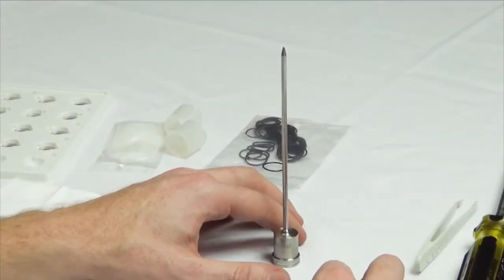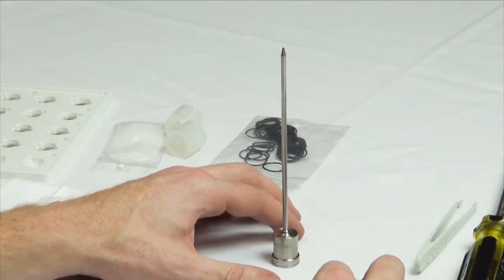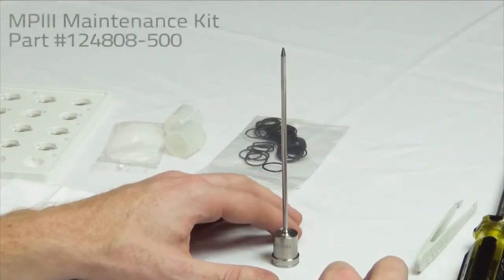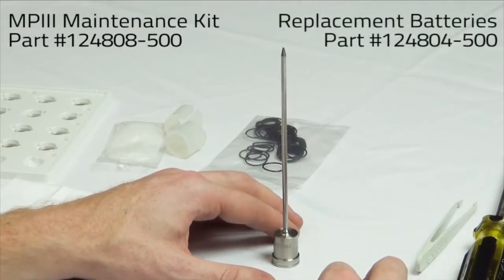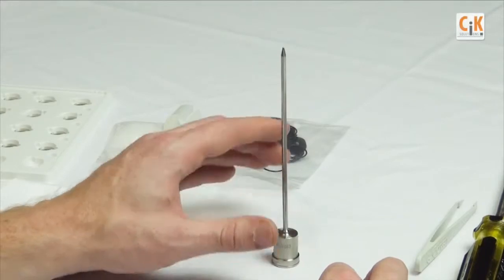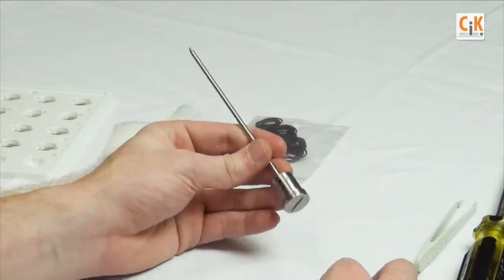In this video you're going to learn how to change an MP3 battery. This video assumes that you're using an MP3 maintenance kit part number 124808-500 and replacement battery parts are 124804-500, and that's a package of 20.